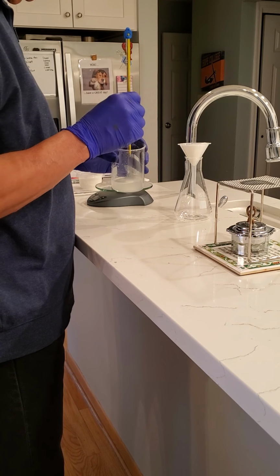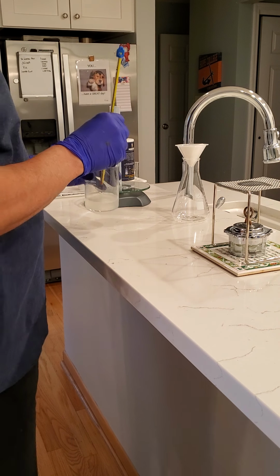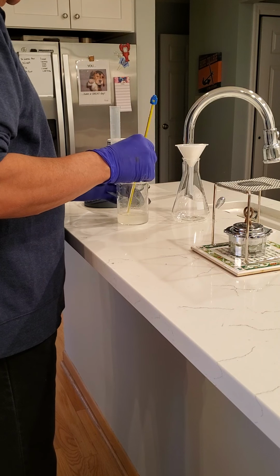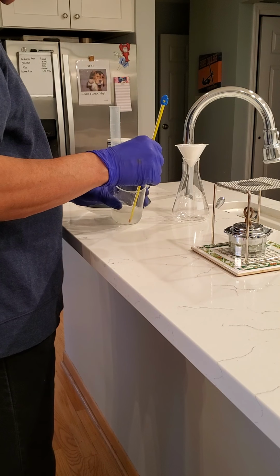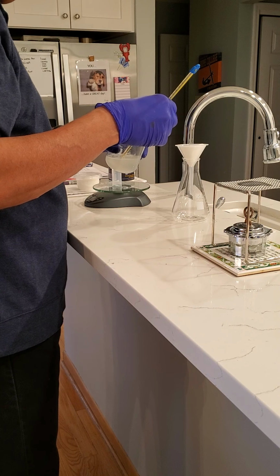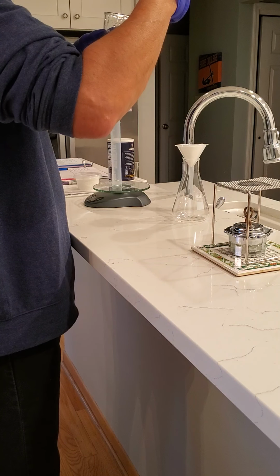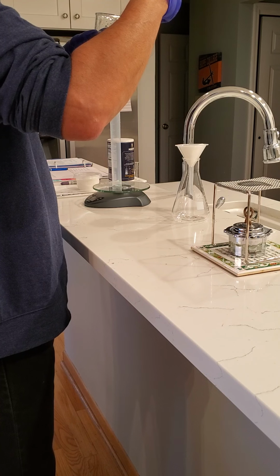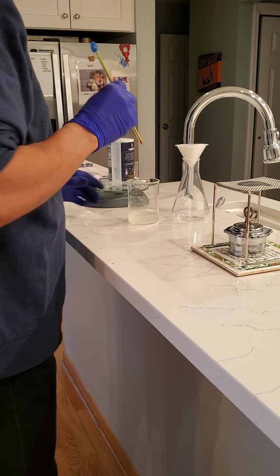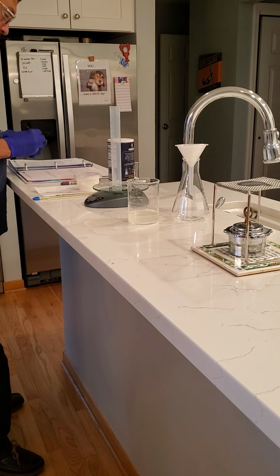Okay, class, so I prepared a saturated solution. I can tell it's saturated because there's solid sodium chloride in the bottom. It's no longer dissolving, no matter how much I add to the water. We also want to record the temperature because solubility is very much related to the temperature. It must be pretty cold water. So I've got about 15, 16, 17, 18.0 degrees C. I'm going to record that as my temperature, so be sure you jot that down. 18 degrees.